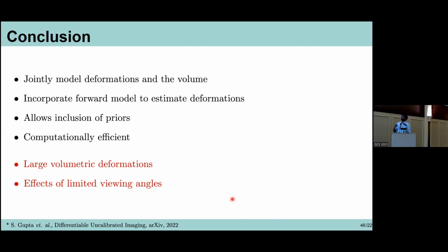I think we followed what standard methods did, which looked at deformation at the projection. If we assume a rigid volume, we look only at deformations in the projection itself. Deformations in the volume would be much harder, and we have not done it in this work yet. Thanks.